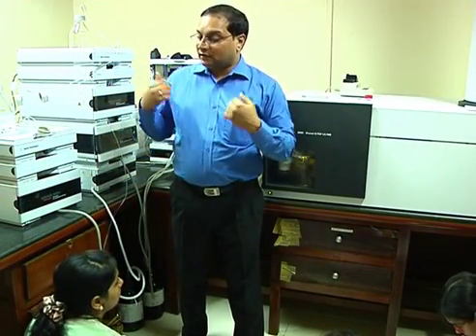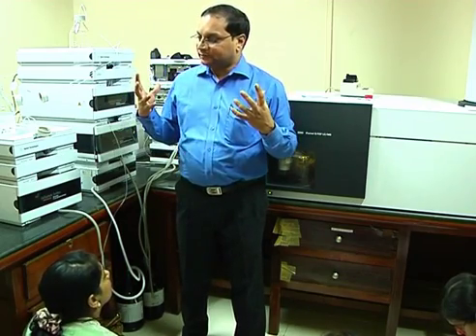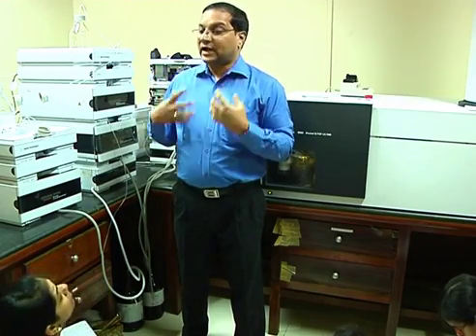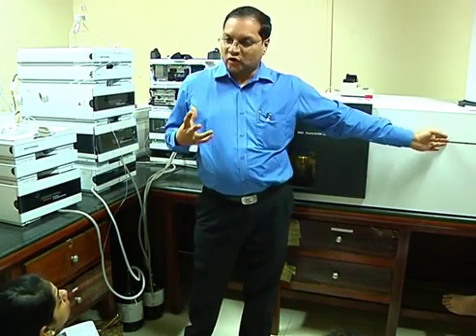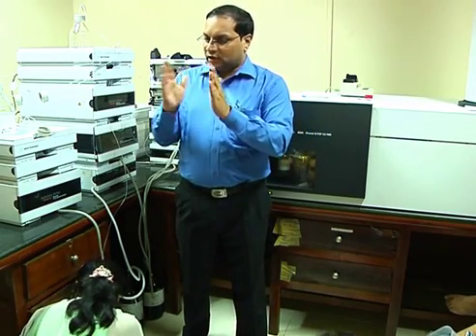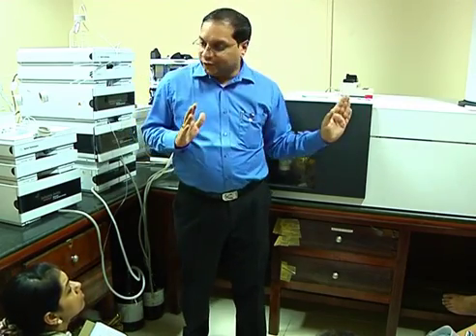Okay. For our case, in an unknown scenario, we know that there are different types of protein, and I don't know about that protein. So in the first place, I want to establish the identity of that protein. So I need accurate mass information. I cannot use a triple quad type of device which has unit mass resolution. It cannot see beyond 1 Dalton difference. So hence it is not accurate.